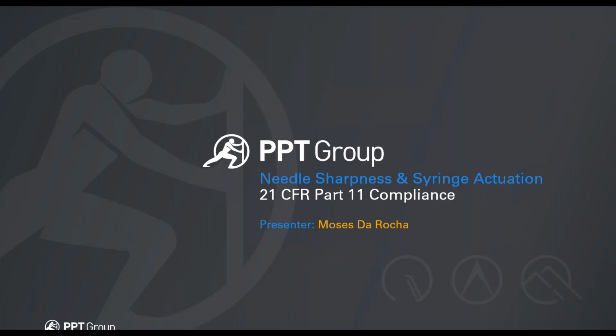Welcome, everybody. We're thrilled to have you here today for our live demonstration on needle sharpness and syringe actuation testing, with a particular emphasis on compliance with 21 CFR Part 11.